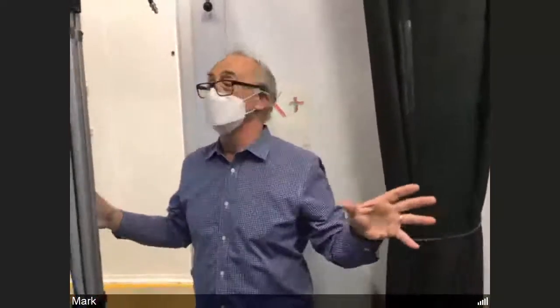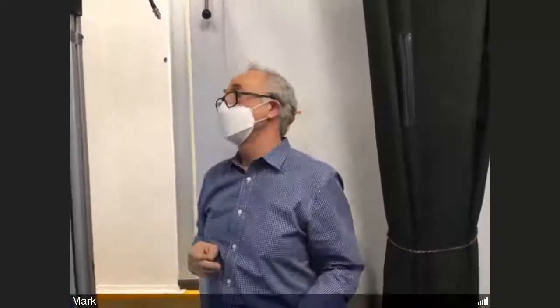And of course, the radiation levels in this enclosure are extremely high, particularly with pink beam. So no one is allowed to be in this enclosure when the experiment's going on and there's a fairly elaborate safety system to ensure that. And so once we are ready to turn on the beam, we'll do a search of the hutch to make sure nobody else is in here.